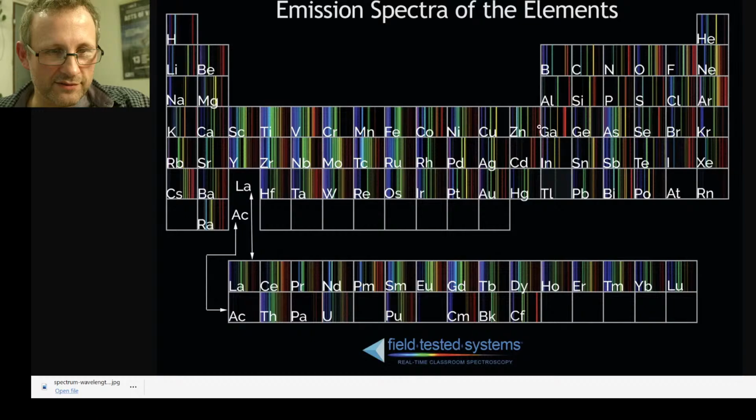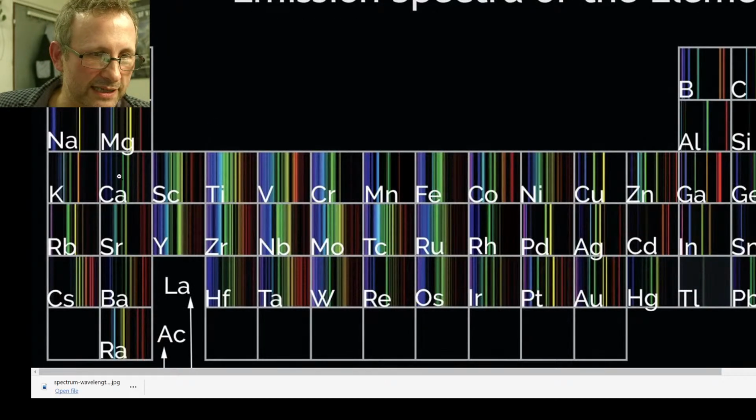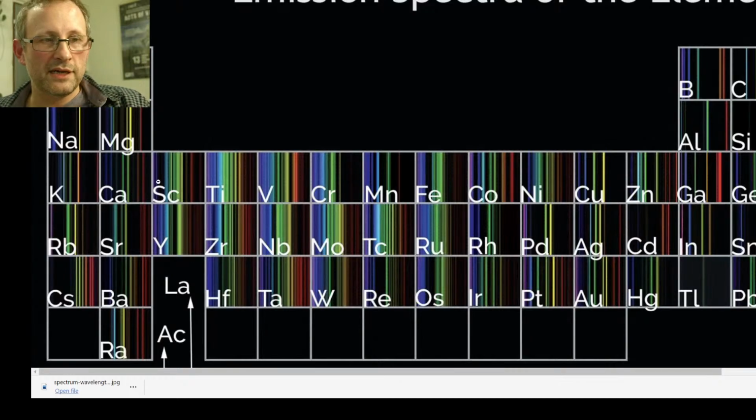But if I come out of this and we see calcium, you can see that calcium has multiple lines, and that the calcium has several isotopes. So if we see an increased production of calcium, we could then consider doing some isotopic analysis using a different technique, because we think we might have created some calcium, and does it produce a natural ratio of isotopes.